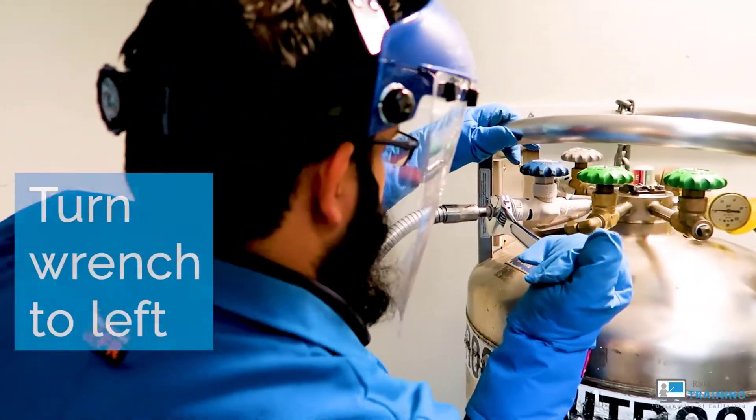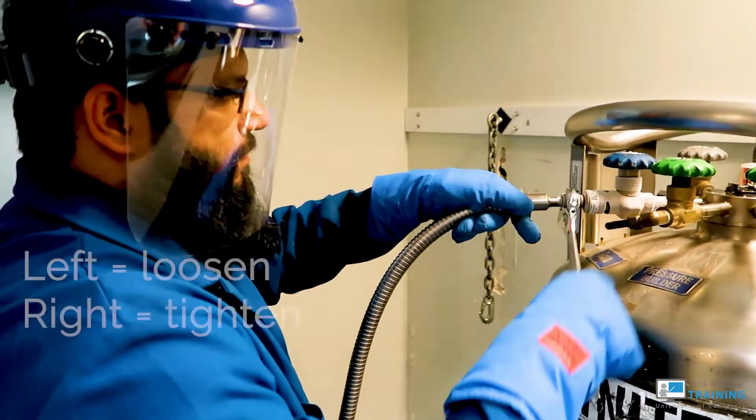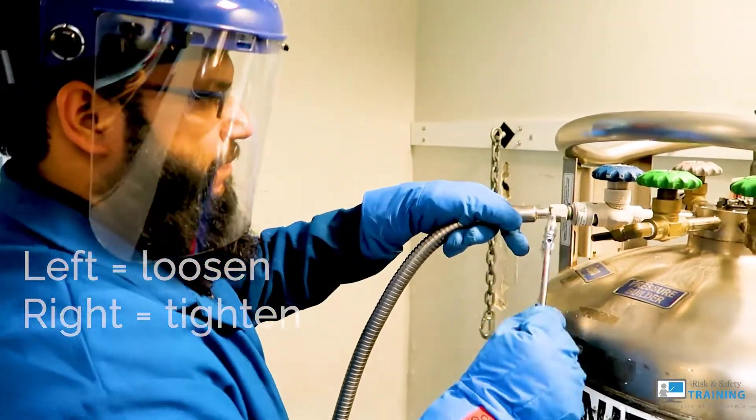Use the wrench to turn the valve nut to the left. Follow our rule of thumb: lefty loosey, righty tighty.